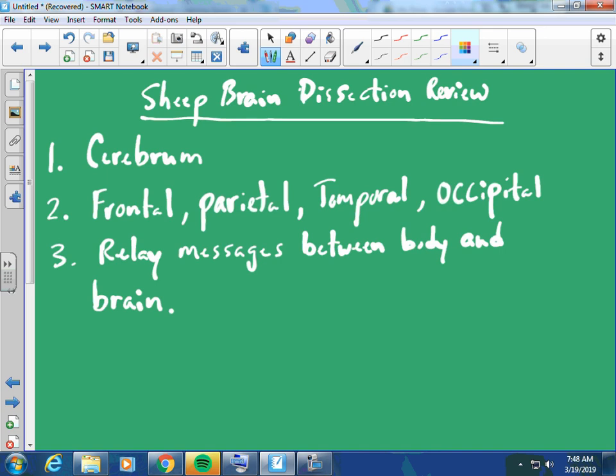All right. And number 4, describe the location of the pineal gland. What is its function? So describing the location. What do you guys think? Any ideas? How can we describe its location? Is there some kind of landmark, easy to see thing around it? So I say if you know the thalamus, which is kind of like a circular region, you can kind of see the circle. It's kind of notable. This is pretty easy to find.